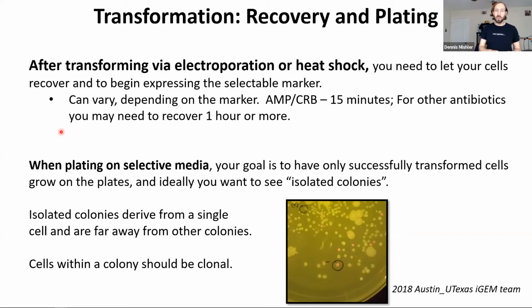After the recovery is done, you're going to go ahead and plate your cells, your transformation mix, on selective media. Your goal from this is to have successfully transformed cells that are growing on the plate, and ideally as isolated colonies. Okay, so this circled one down here, for example, is an isolated colony. It's isolated from the other colonies, so it's further away, and it's a colony of cells.